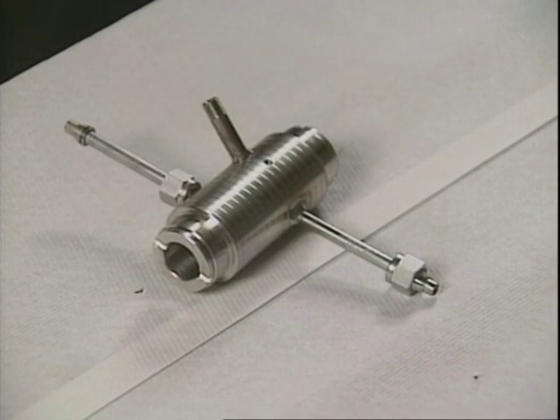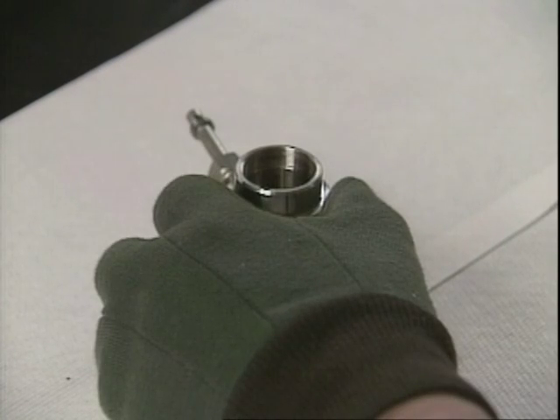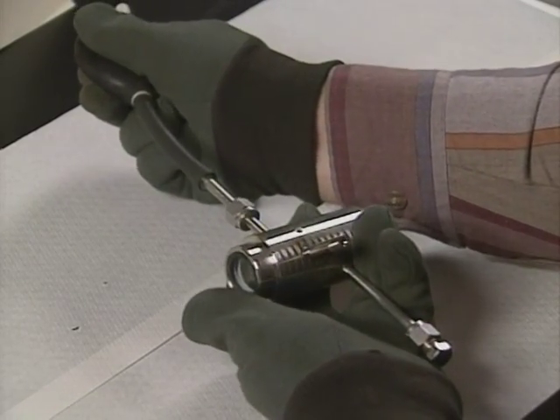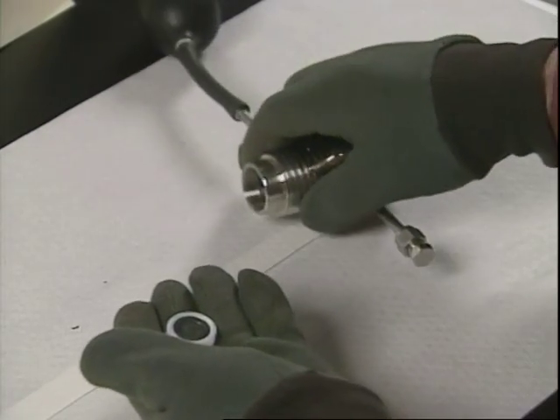Begin cell window removal by ensuring that the flanges have been removed from the cell body. Remove the necessary hardware to access the window. The following procedure will help avoid window damage. Seal the outlet and hold the cell so that the window will not drop out. Connect a hand-operated aspirator to the inlet. Apply gentle pressure to lift the window up squarely and remove it.